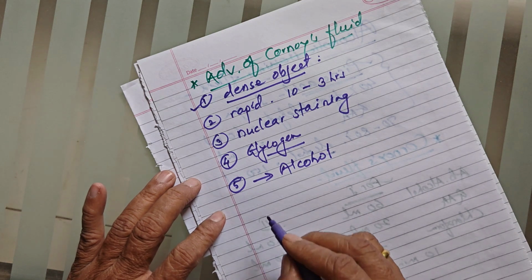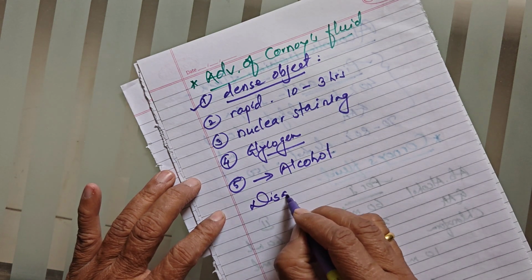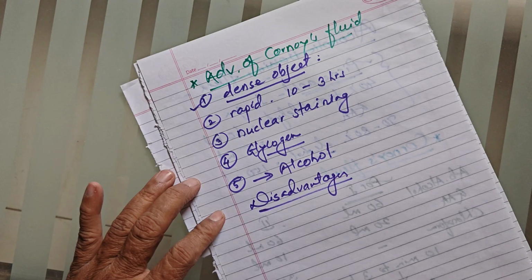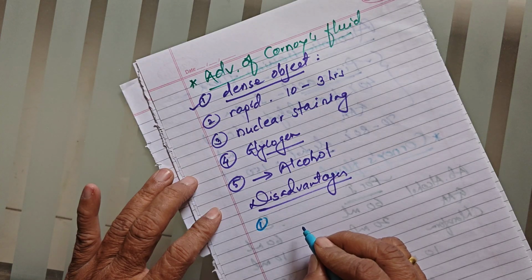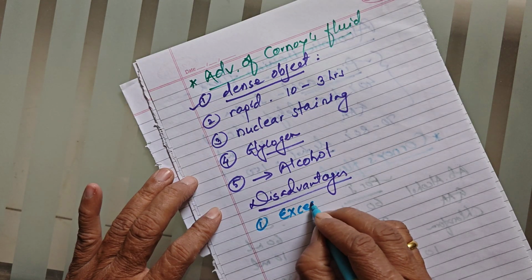Though it has advantages, it has a few disadvantages. Disadvantages of Carnoy's fluid. The first disadvantage is that this fixative causes excessive shrinkage.